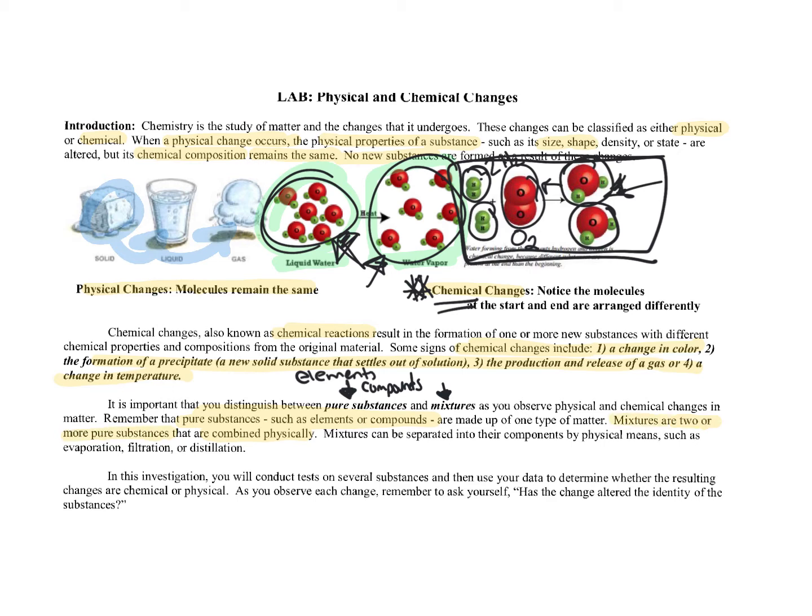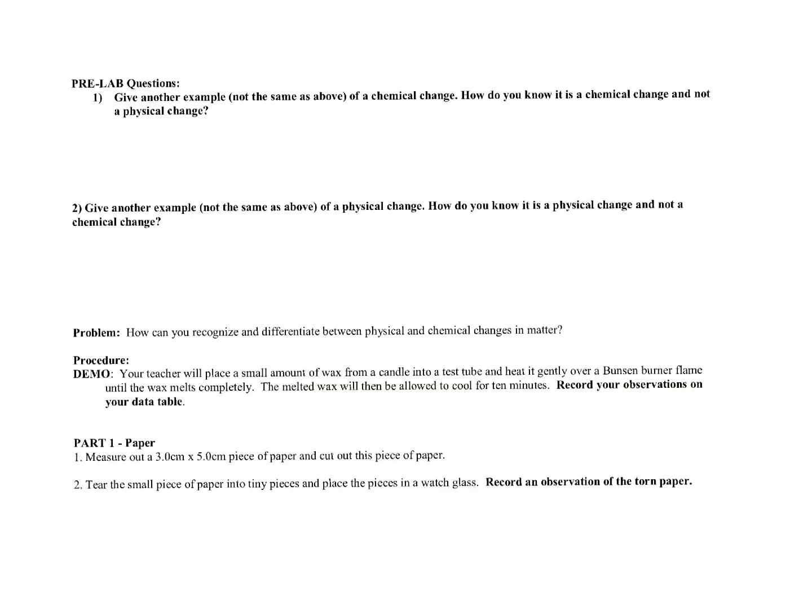And we can usually separate them by physical means, either by evaporating a liquid and leaving the solid, perhaps by filtering out a solid, or by distillation. These are all things that we'll practice in the laboratory. So if you would, please pause and take a minute to fill in the 2 pre-lab questions to get yourself prepared for our lab.